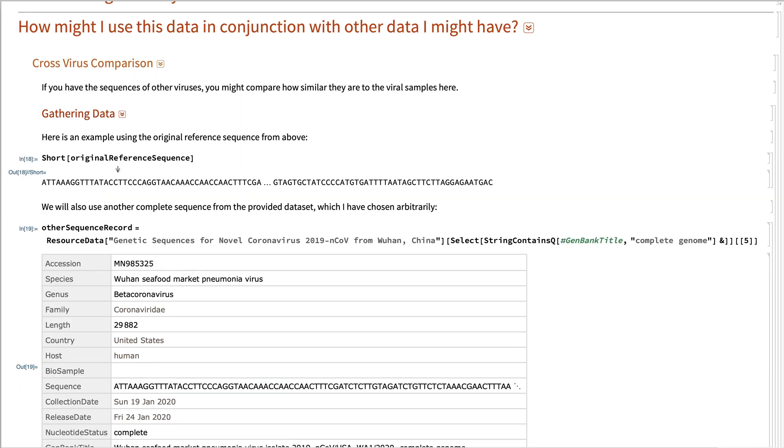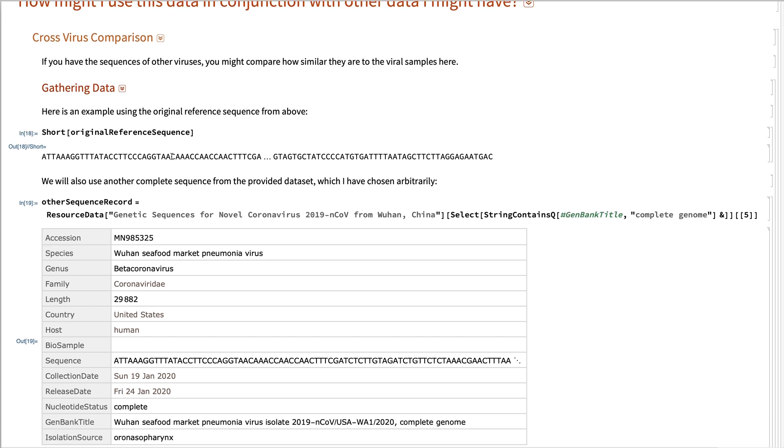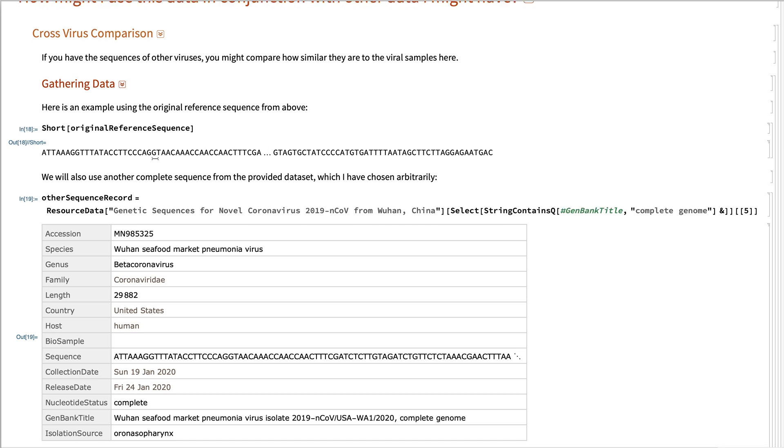So here I'm going to be using, gathering the original reference sequence, the one believed to be at the root of the phylogenetic tree as originally discovered in China.